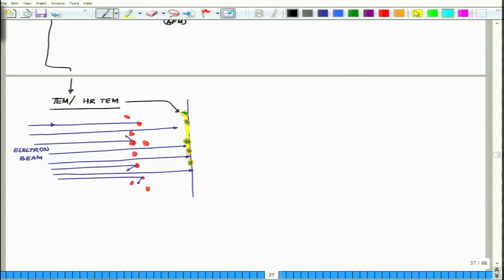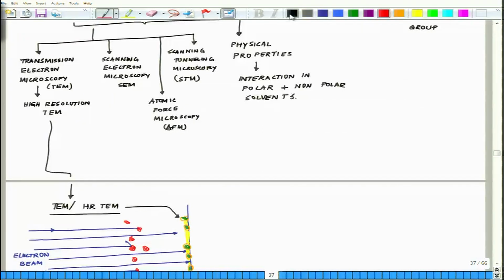So out here you shoot the beam with a certain energy, okay, some X amount of energy, with which electron volt you are shooting the beam. Now what do you do? So here again you are having a sample, same situation. So now we'll be talking about the second technique, which is your scanning electron microscopy.